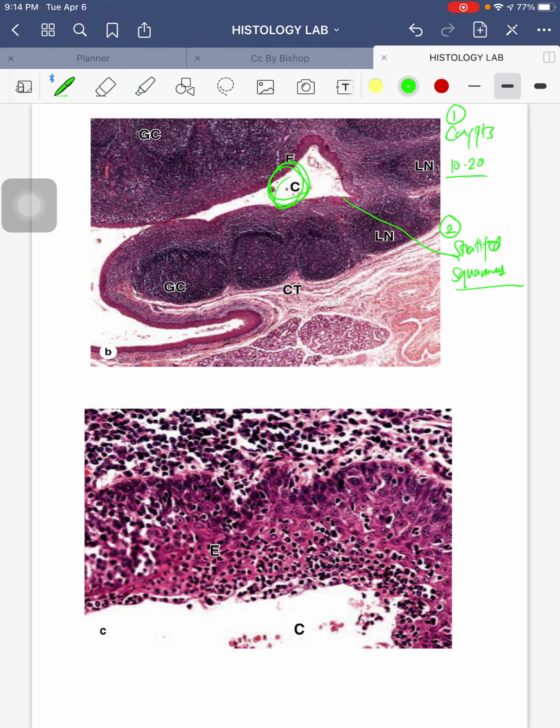The third consideration, now we will go to the lymphoid tissue. This is what's characteristic of most of the lymphoid tissues that's evident, except thymus. In thymus, we didn't really see these packs of lymphoid tissue. And I believe you already encountered this in your lymphoid connective tissue. This is just a repeat. So the third consideration will be your lymphoid nodules, as you can see there.